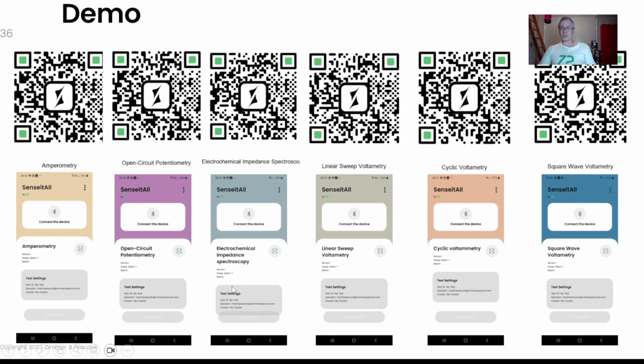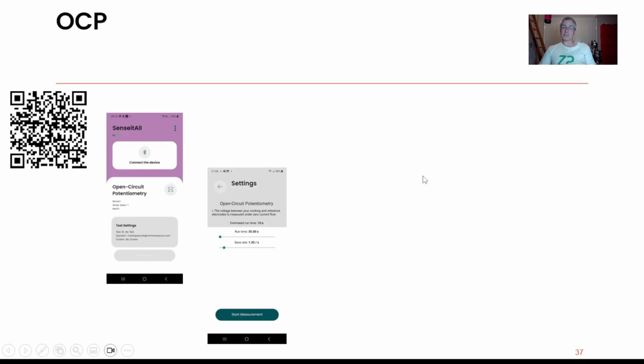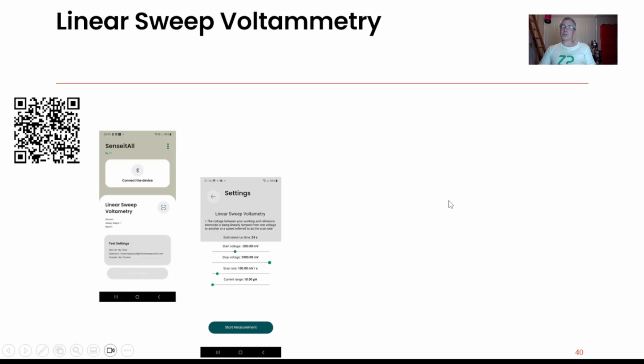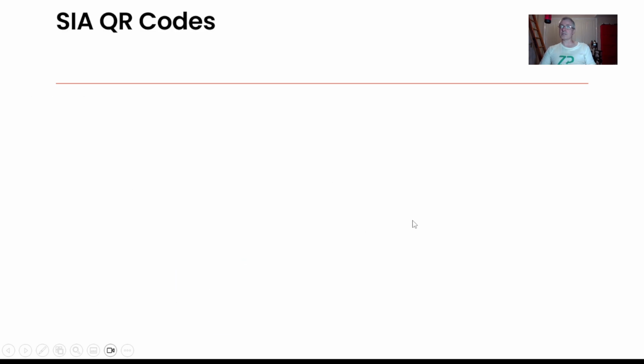You can scan all these QR codes if you end up installing the app on your phone, and you'll soon see that as long as you've got the hardware, you're able to get into all these things and start playing with all the settings. Maybe if you're watching the video, you should actually pause me as I went a bit quick. There's impedance spectroscopy as well.